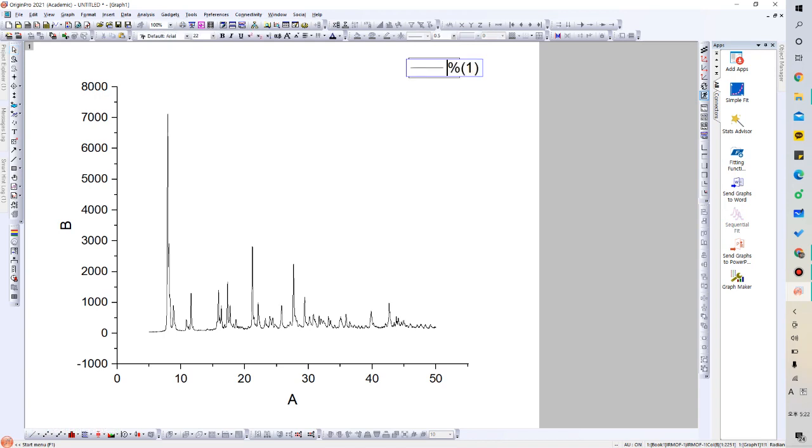You can render minor stuff such as turning this into MOF5 and changing the y-axis into intensity. Our school's PXRD diffractometer, which is located in Changjo-1 6th floor, has the dimension of counts per second, in short CPS. So you could insert that in the y-axis.